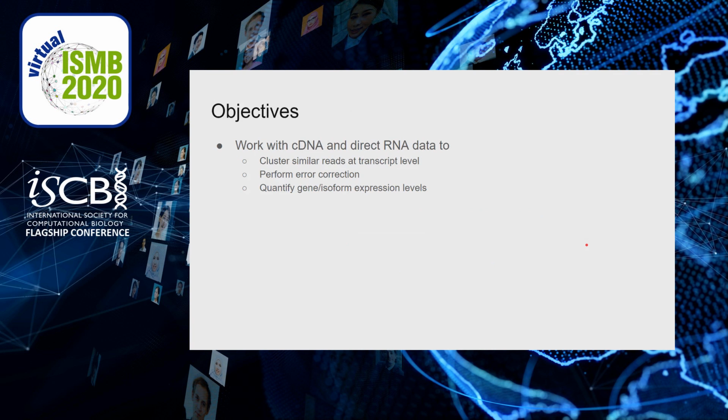So we wanted to build a tool to work with cDNA and direct RNA in order to cluster the reads that originate from the same transcript together, then perform an error correction to improve the error rate, and finally, with this information, produce a final transcriptome along with the expression level of each transcript. And we wanted to do all of this without using a reference genome or transcriptome.